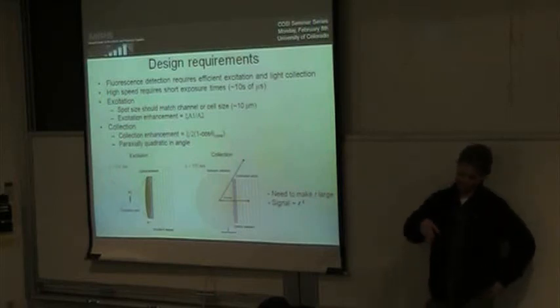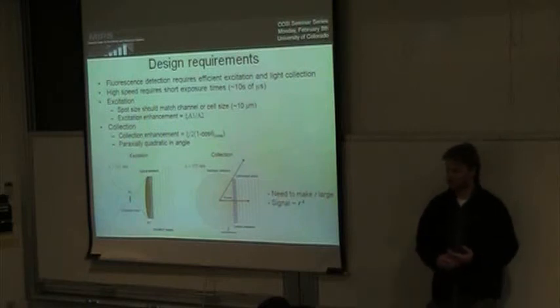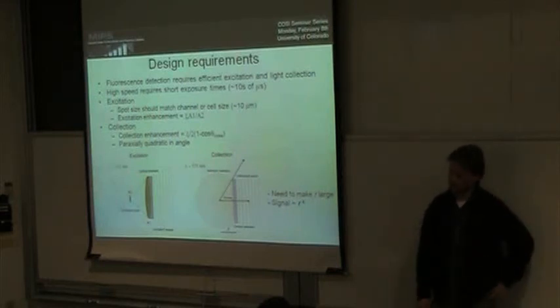So that will follow the Poisson distribution, and very rarely will they ever get a drop that has 2 in it, although that will happen sometimes. They do it by having most of the drops be empty.